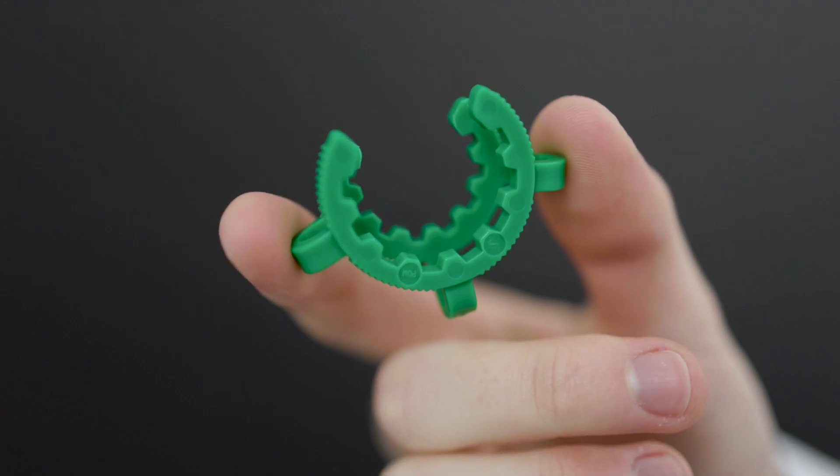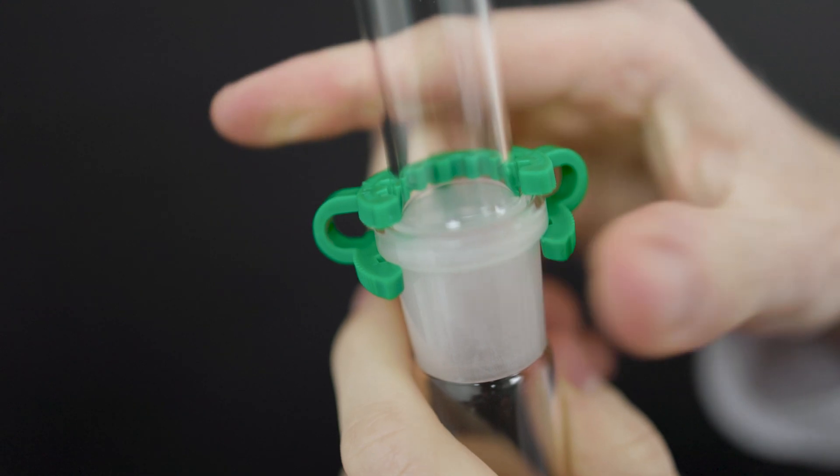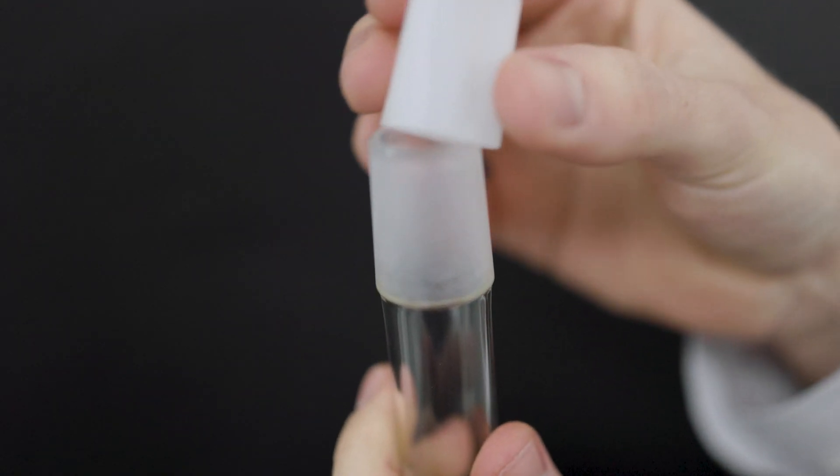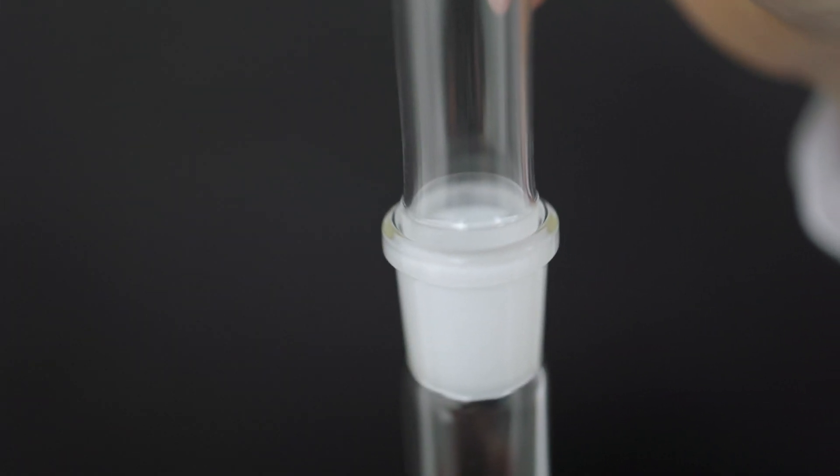These joints can be secured using Keck clips, which are available in a variety of sizes. In use, it is a good idea to lubricate ground glass joints with an appropriate grease. Alternatively, PTFE sleeves can be interposed between the male and female joints to avoid wedging them together, as they can become stuck or frozen.